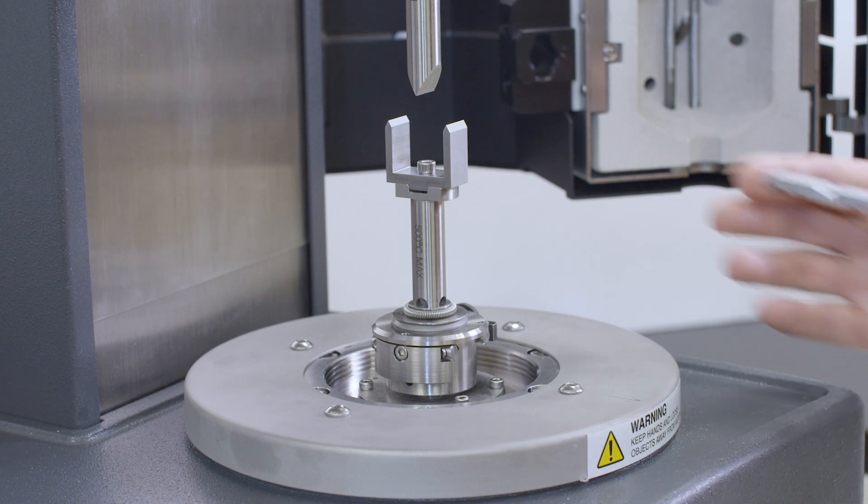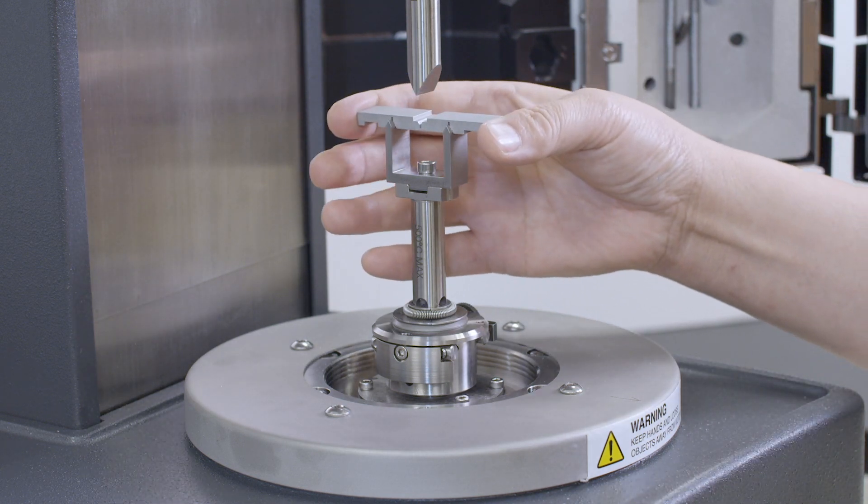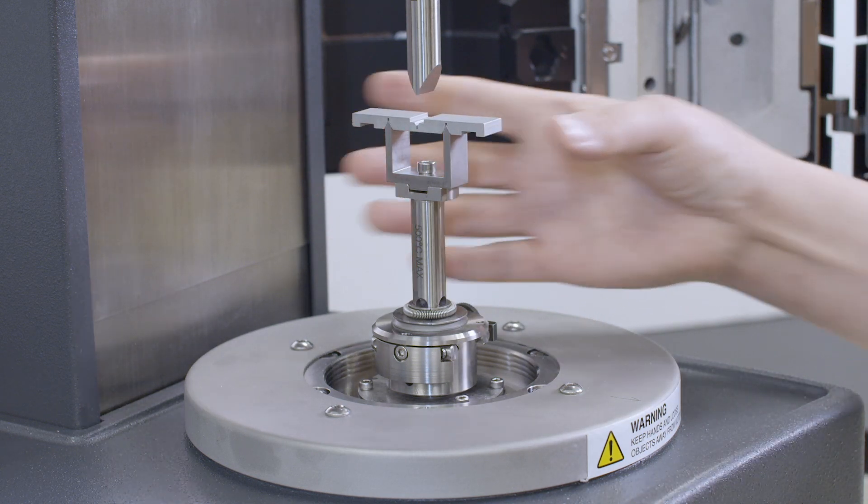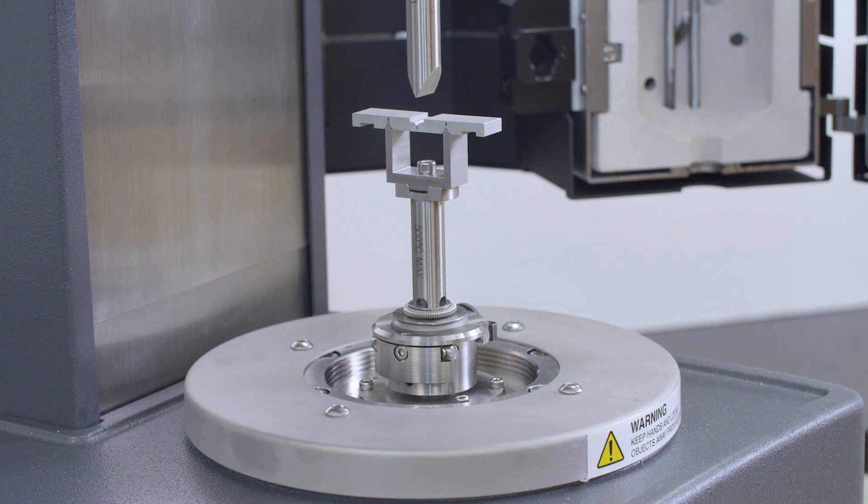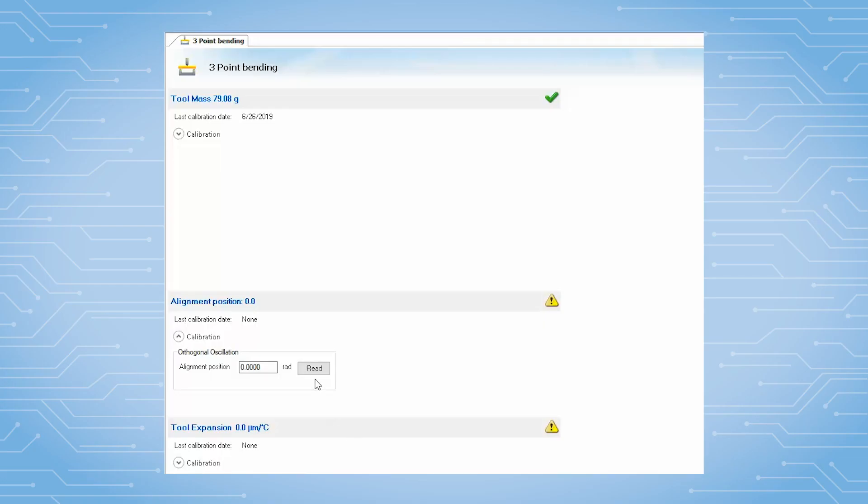Place the alignment tool onto the bottom clamp frame. Carefully lower the upper geometry until the upper tool is inserted into the center v-slot of the alignment tool. Use the TRIO software to read the alignment position through the geometry calibration.